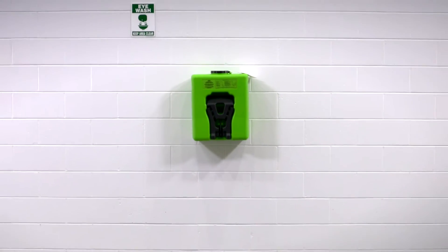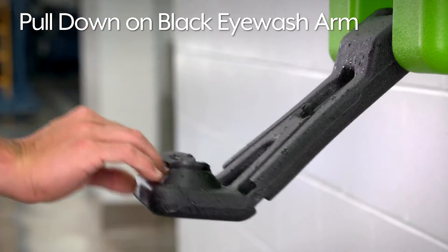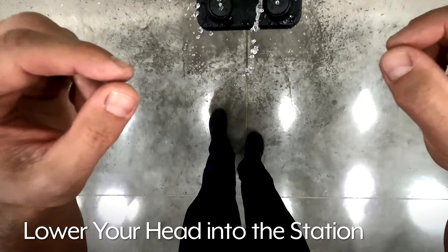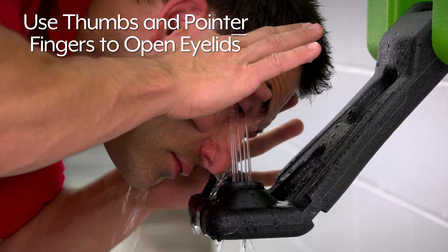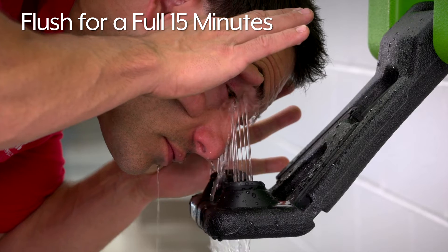To use the Slim Flow Eyewash Station, first pull down on the black eyewash arm, then lower your head into the station and use your thumbs and pointer fingers to fully open your eyelids and flush for a full 15 minutes.